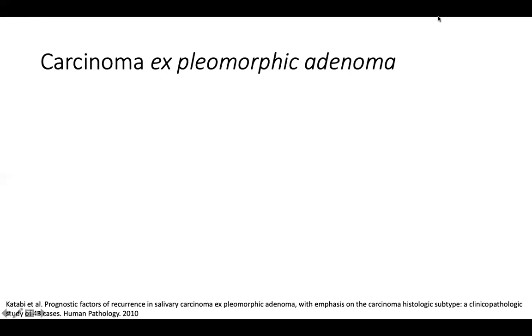Oh, okay. That's a good question. So there aren't good studies on that. But typically I would say when you do a PA gross, what you want to do is just slice it up and just do a typical gross examination. Look for any areas that might be concerning for necrosis or anything like that and submit those areas. But there isn't a good study on the percentage that you need to submit in order to confidently make a diagnosis of malignancy.